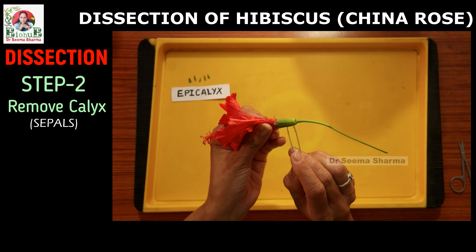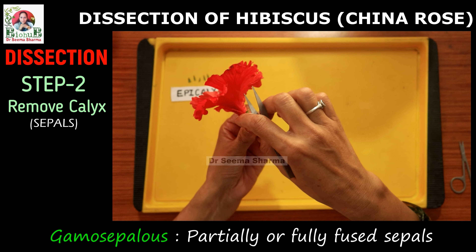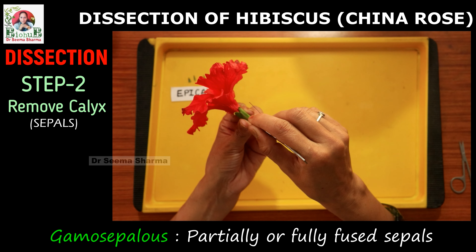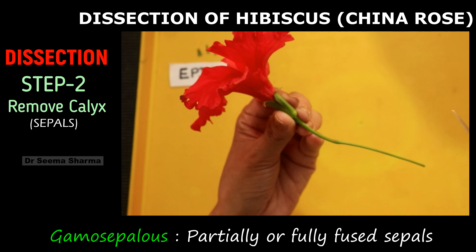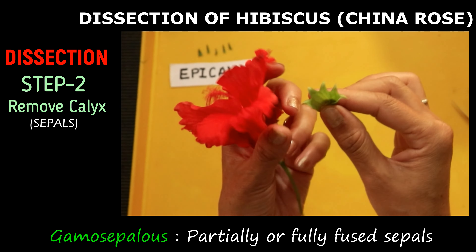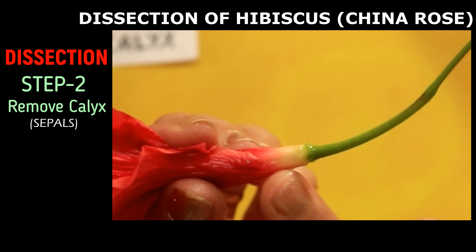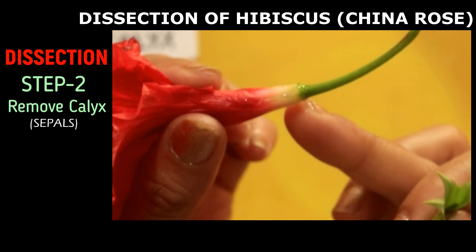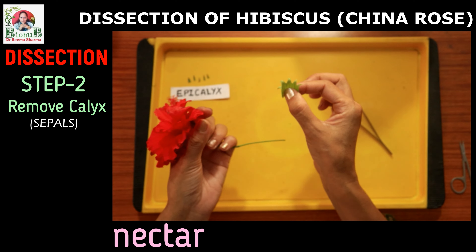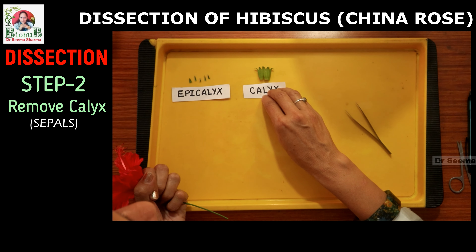Next we will dissect the calyx. The calyx of hibiscus comprises of 5 green fused sepals — the technical term for fused sepals is gamosepalous. To remove these, I am making a slit using a forcep; you can also use a needle or blade. Then with your hands detach this whorl of fused sepals. As you remove the calyx, the base of the petals is exposed. Here you will notice the presence of slightly sticky, colorless and fragranceless fluid — it is nectar, the same nectar which attracts pollinators like honeybees and butterflies. Now place these sepals on the dissection tray and annotate them as calyx.